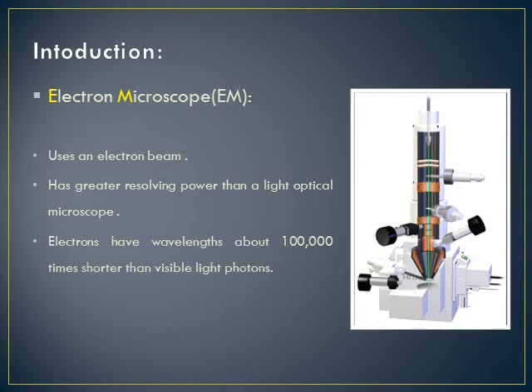The electron microscope uses electrostatic and electromagnetic lenses to control the electron beam and focus it to form an image. They can achieve better than 50 pm resolution and magnifications of up to about 10 million times, whereas ordinary non-confocal light microscopes are limited by diffraction to about 200 nanometer resolution and useful magnifications below 2000 times.